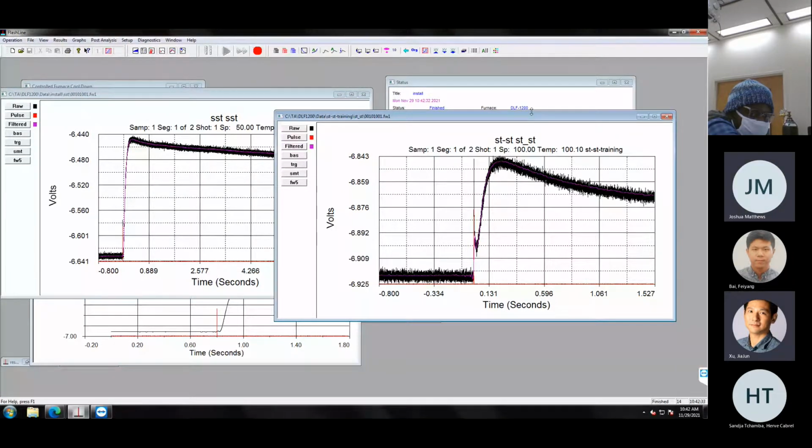Well, I was just working with a customer recently who was working with a glass sample, right? So glass is see-through. If you put it in there and take a couple shots at it, you're not going to see what we see here. You'll just see a baseline, and then straight up. You see how this black line comes straight up here? You'll see just that, and none of this. This graph will not be here, because it's not able to absorb the laser energy.